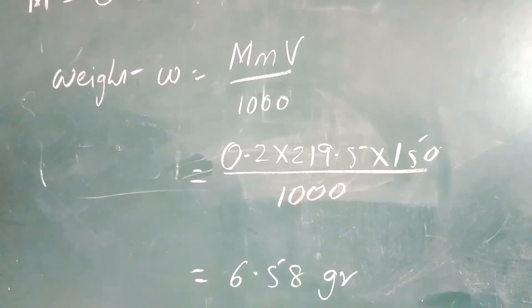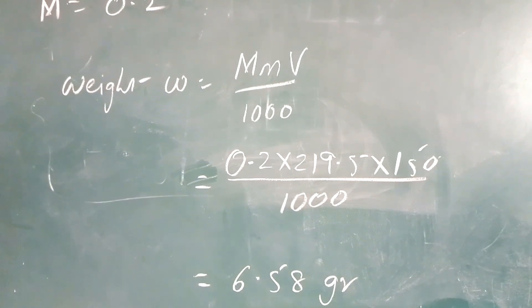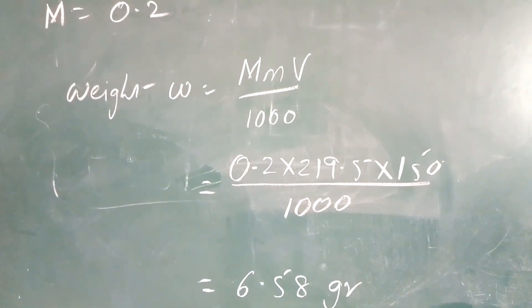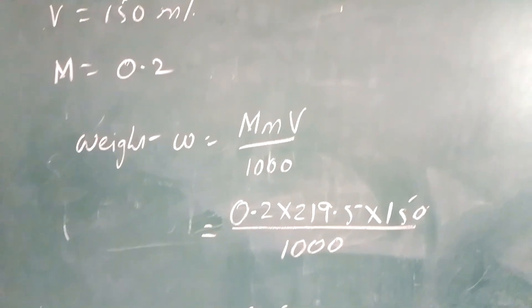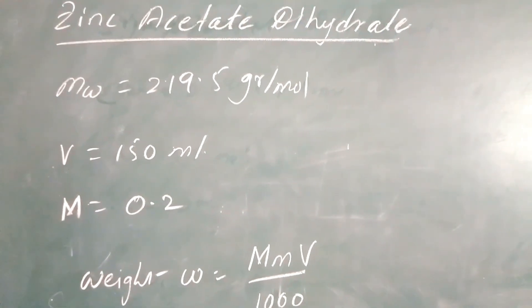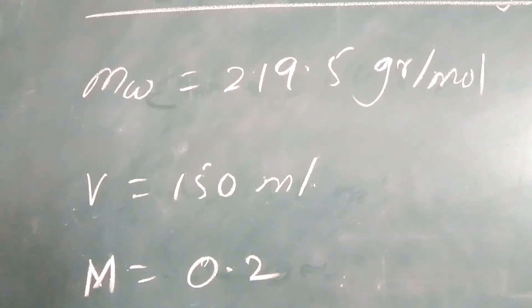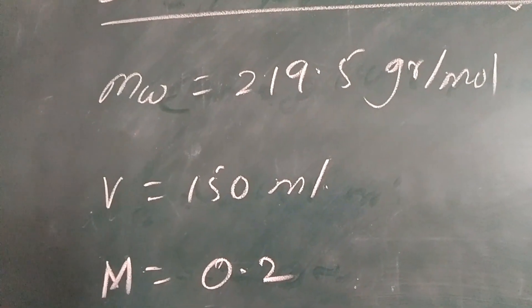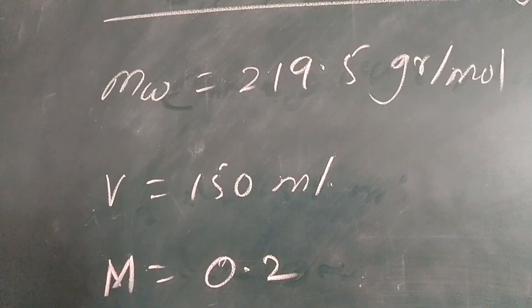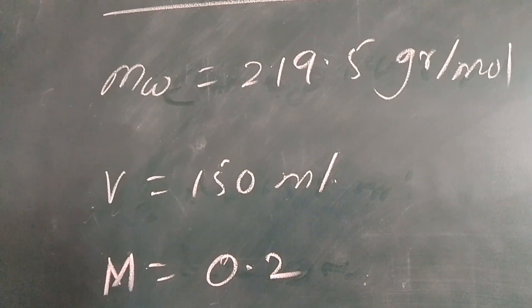Approximately I am going to take 6.6 grams of zinc acetate dihydrate and I will dissolve this 6.6 grams into 150 ml of the solvent which is the mixture of methanol and 2-methoxyethanol.